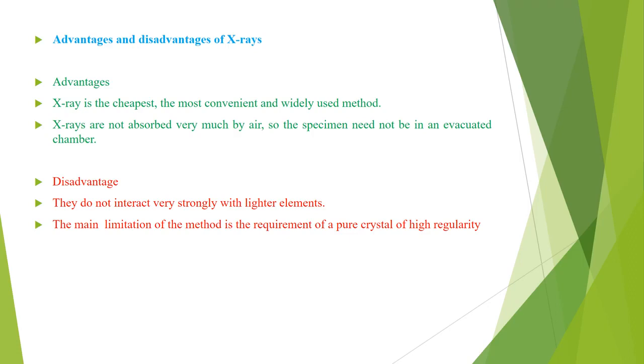And then when we discuss the disadvantages of the X-rays, these are that they do not interact very strongly with lighter elements. So this is one of the main disadvantages of the X-ray analysis, that when we are studying the lighter elements, it makes it difficult to study because they don't interact very strongly with those lighter elements.